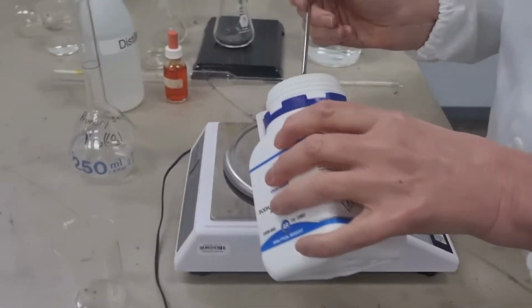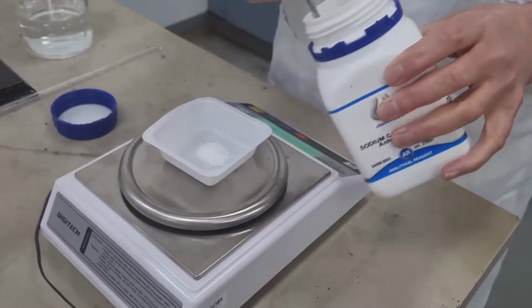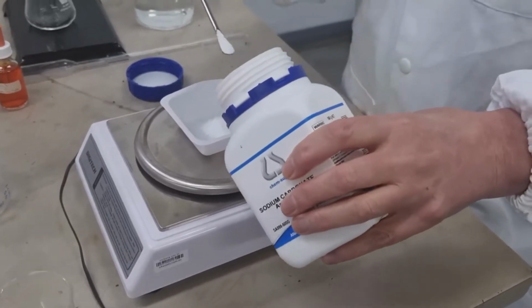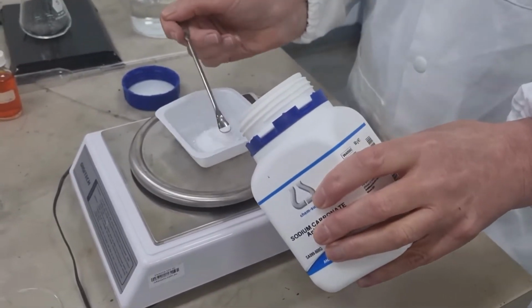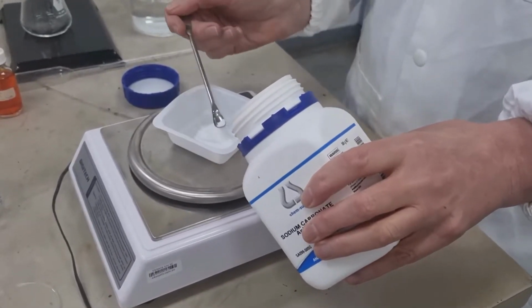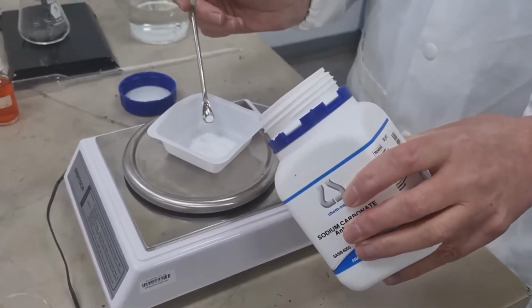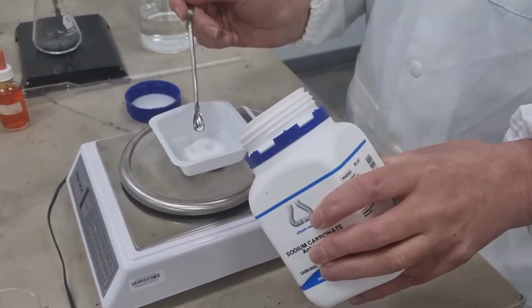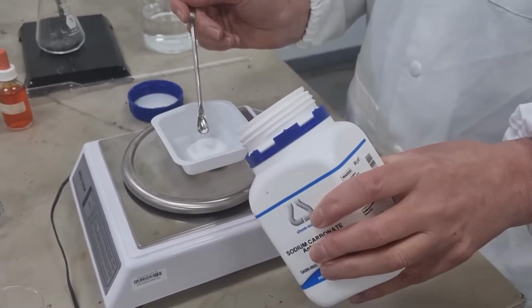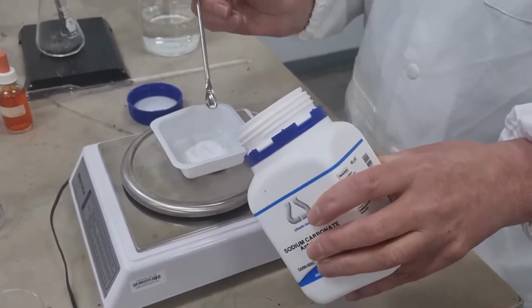This sodium carbonate is anhydrous sodium carbonate. So this time, you'll see that we need 2.65, and we need to weigh this out accurately. And I'm doing it too fast and not concentrating. 2.65, so that our primary standard we know the concentration of.